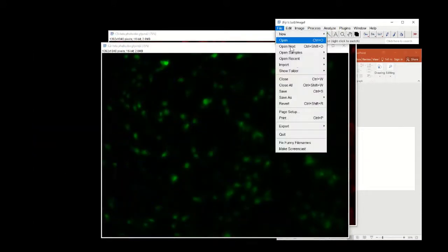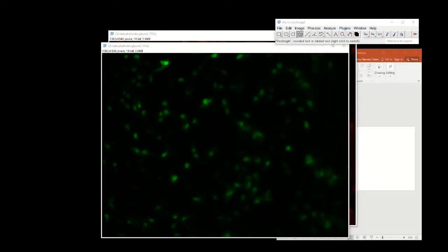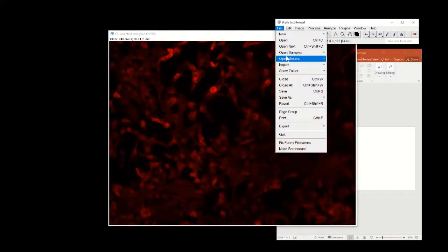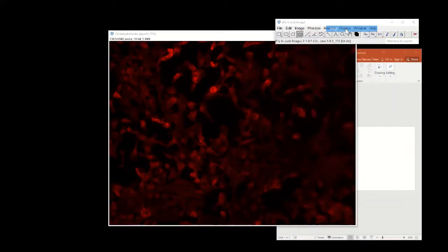This is going to be my green channel, so I'm going to save it once again as my green channel, and I'm going to close it, and then I'm going to save this as my red channel, and then I'm going to close this window. So what do we do next?